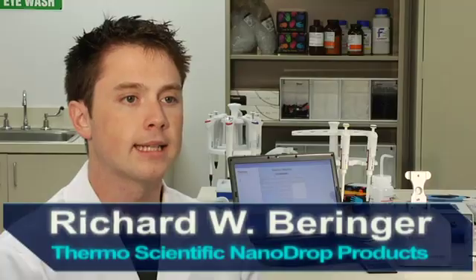Today we will be demonstrating two procedures for determining nucleic acid concentration using Thermo Scientific microvolume instrumentation. The first protocol is a direct nucleic acid measurement using the Nanodrop spectrophotometer. The second protocol is an indirect fluorescence nucleic acid measurement using the Nanodrop 3300 fluorospectrometer.